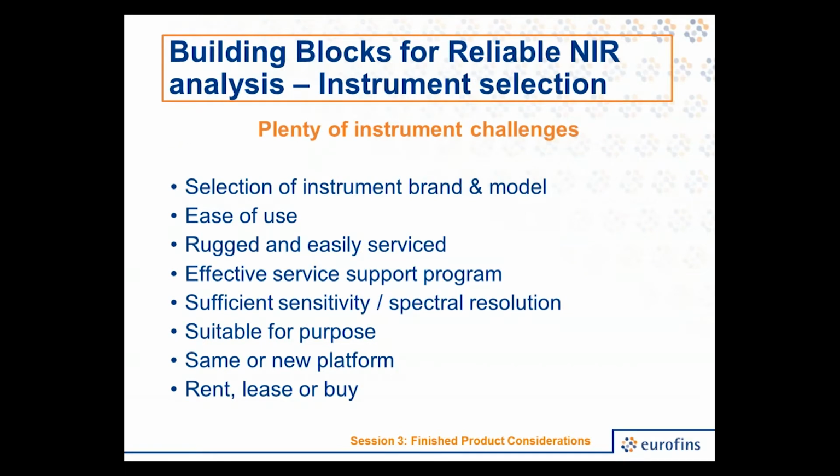So once you're confident with your primary data source, a selection of spectrometers should be trialed to determine the best fit instruments. There are extensive brand options out there and different types of NIR systems available on the market today. Of course, most instrument vendors are selling one platform or one type of near-infrared instrument, and of course, they'll be biased. So there is a need for a non-biased third-party opinion to help with the key factors to consider.